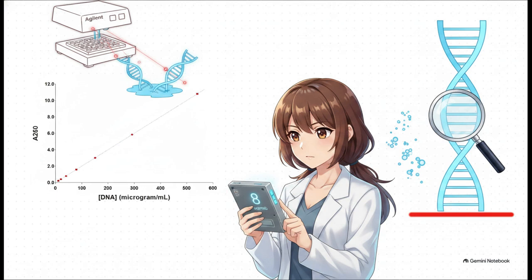And this brilliantly illustrates the real-world application. When Dr. Collum runs this through a microplate reader, the data looks beautiful. The linear relationship between UV absorbance and DNA concentration holds up perfectly. Well, until it doesn't. If you look closely, you can see the limits of the instrument. Standard UV absorbance just bottoms out and loses reliability at around 8 micrograms per milliliter. So, what happens when we need to measure something much, much smaller than that?